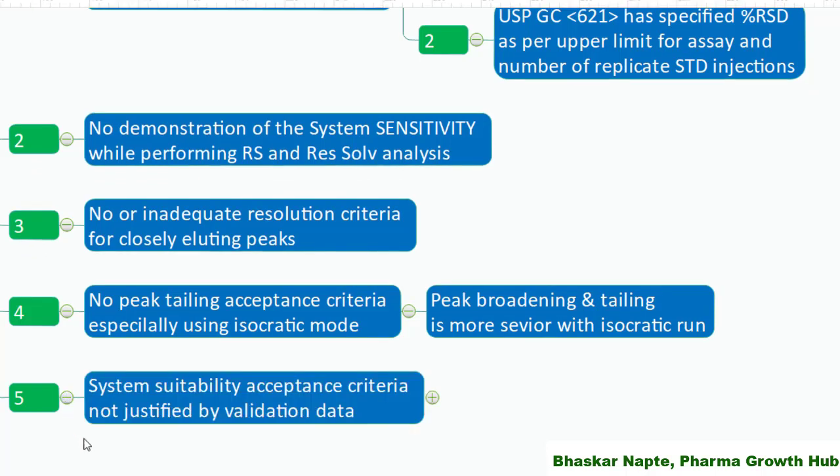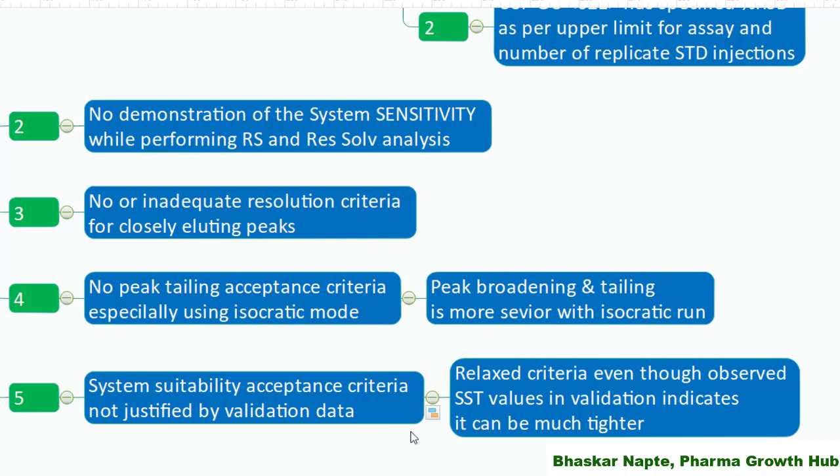System suitability acceptance criteria not justified by validation data. Whatever acceptance criteria you propose for system suitability must also be justified by your validation data. It has been found that applicants tend to set relaxed system suitability criteria even though observed values during validation indicate they could be much tighter. For example, if you propose percent RSD for related substances at not more than 10% for six replicate injections, but validation consistently shows less than 5%, those details must be considered when setting system suitability criteria post-validation.